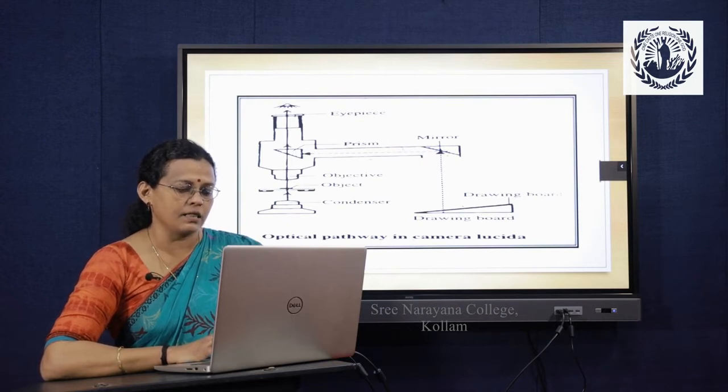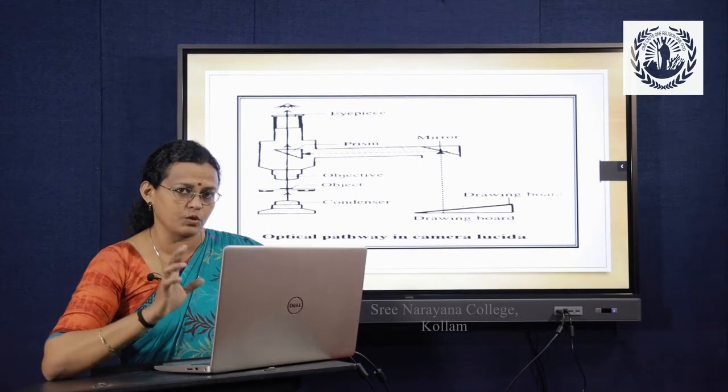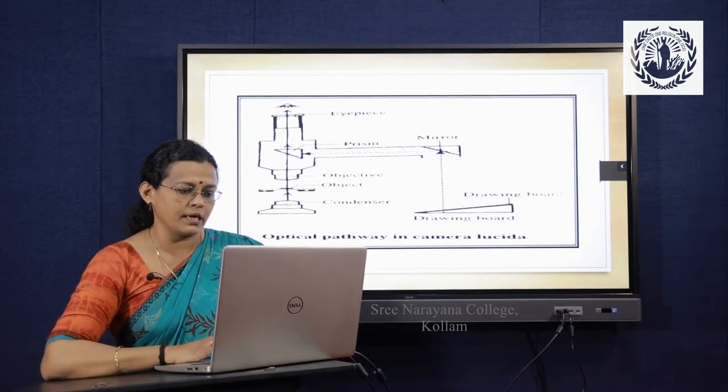You can see the path here, it shows 90 degrees. And from there it is deflected to the prism. And from the prism again it moves at another 90 degrees. So there is a deflection of 90 degrees twice, one at the mirror and the other at the prism.